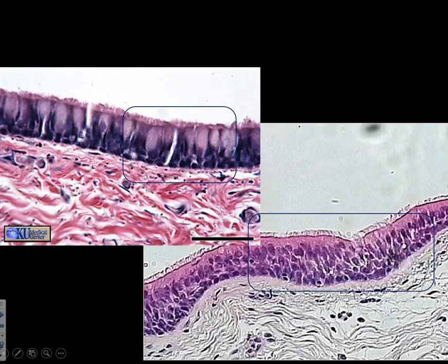All right, let's take another look. Here, epithelial again. We got an apical surface. We got a basal surface. Apical, basal. These little fluffies, those are cilia. Same thing here, these ones are cilia. Now, the trick here is that we can see all these nuclei at lots of different levels, kind of stacked over each other. It looks like there's almost one here, one there, another one up there. It gives the impression that these are maybe cube-shaped cells.